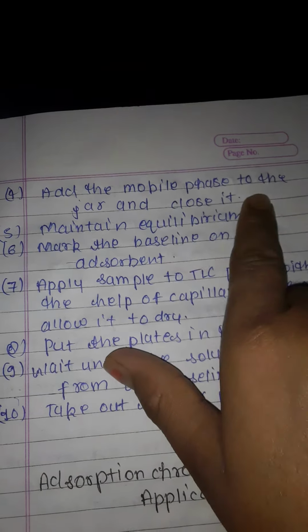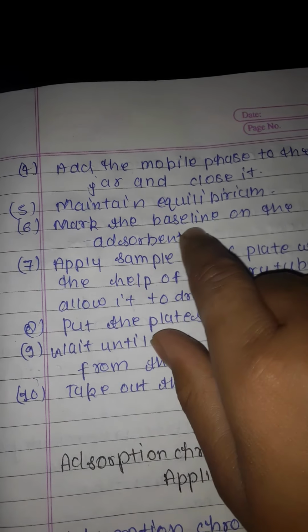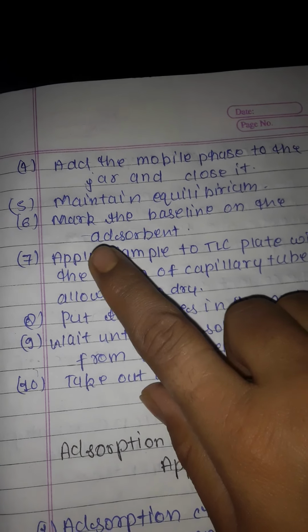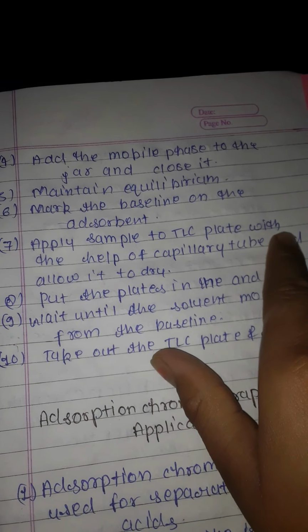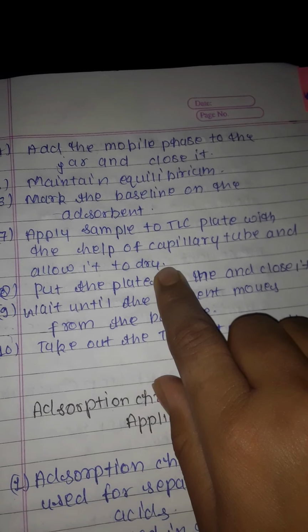Add the mobile phase to the jar and close it. Maintain equilibrium. Mark the baseline on the adsorbent. Apply the sample to the TLC plate with the help of a capillary tube and allow it to dry.